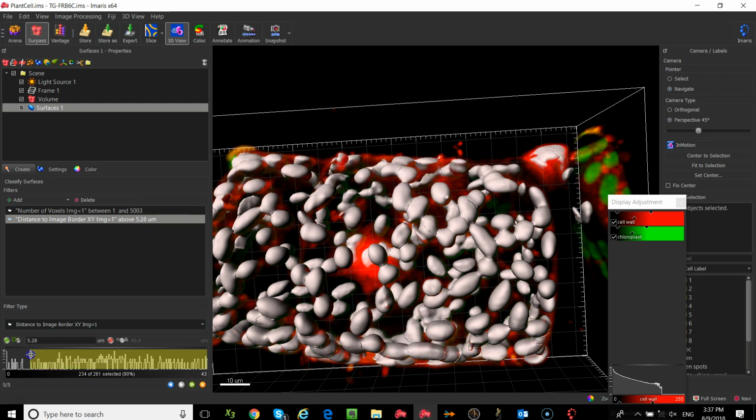this will allow you to set a distance in microns from the edge of the image so you can specify what the exclusion range is around the entire image. Typically people use their cell size as an exclusion zone right around the edge. If you know you're working with a 10 micron cell, you would use a 10 micron exclusion all the way around. That just means that you are not counting or measuring half a cell or a portion of a cell. Just as an example, here's 10 microns, and you'll see it removes all of the structures that are within 10 microns.